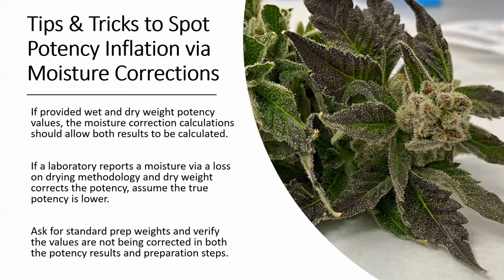And laboratory information management systems, so the LIMS systems, are a great tool for laboratories, and they can ensure that laboratory processes are being handled appropriately, that conversions are happening correctly, and that nothing is being skewed due to errors in calculations that are human error.